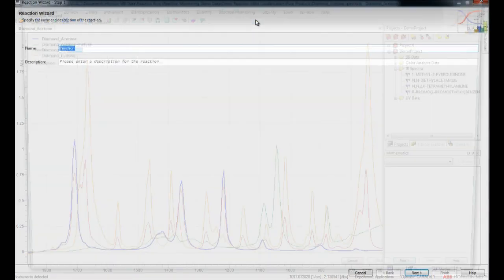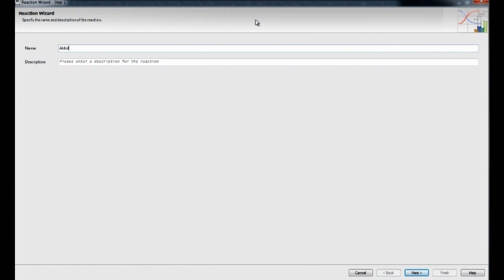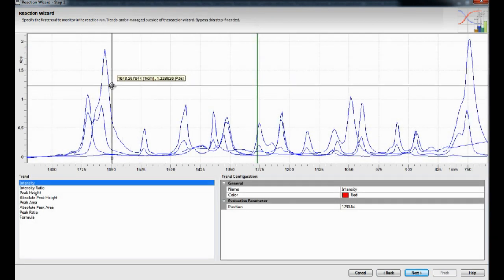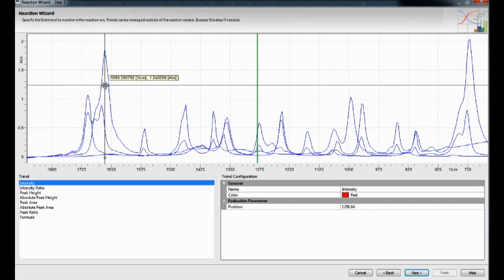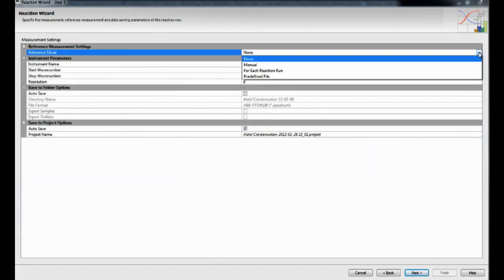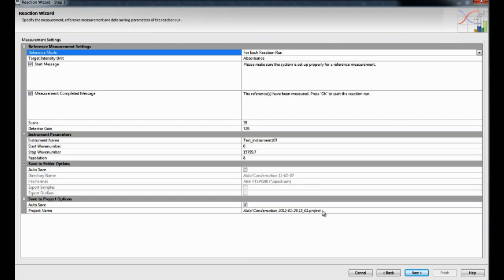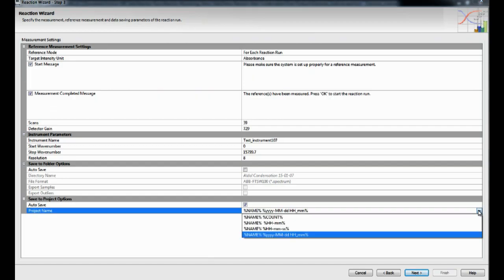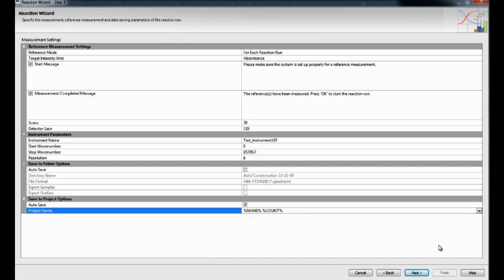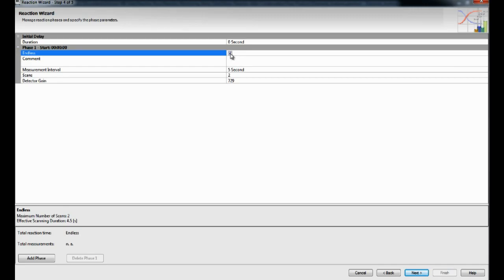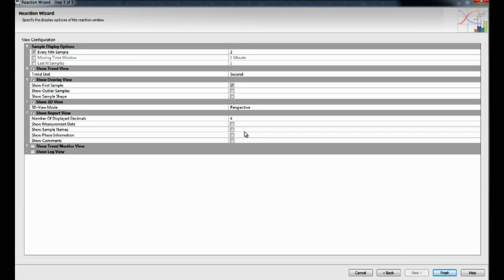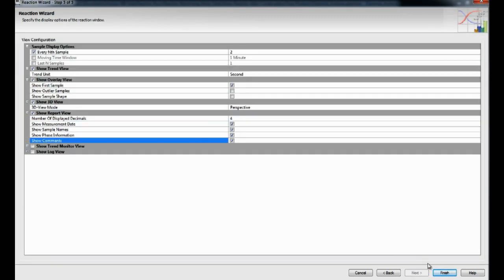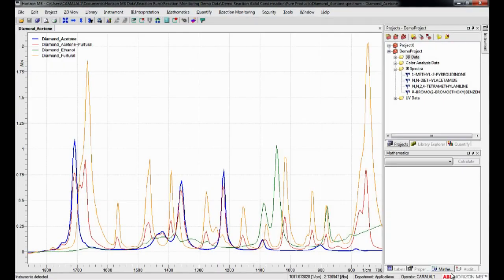Running experiments is straightforward, thanks to the use of a dedicated reaction monitoring software interface. The Reaction Configuration Wizard takes the user through the critical steps of the experiment setup process. With only a few clicks, the user can create a customized template that will be saved automatically and made available for optimization or quick reuse.